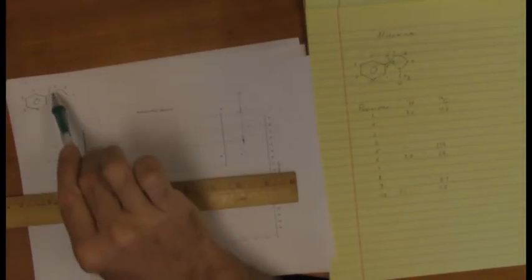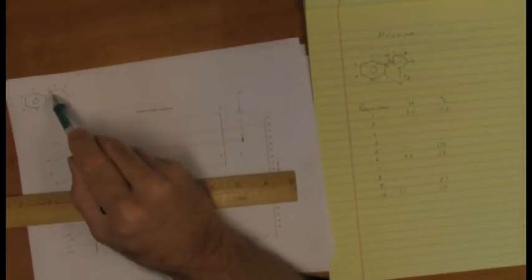It's not a huge surprise. We've seen this before: cyclic molecules with CH2 groups in them. This is quite common. But this one is also a chiral molecule. I specifically marked the stereochemistry there at position 6 when you look up the structure of nicotine.